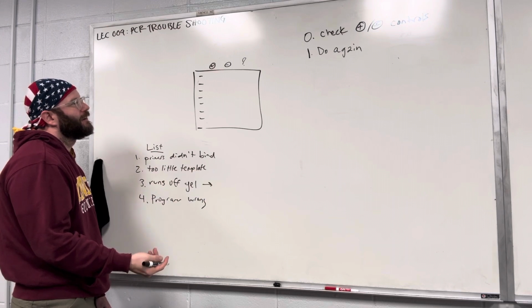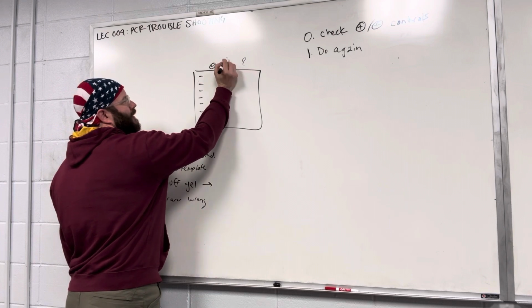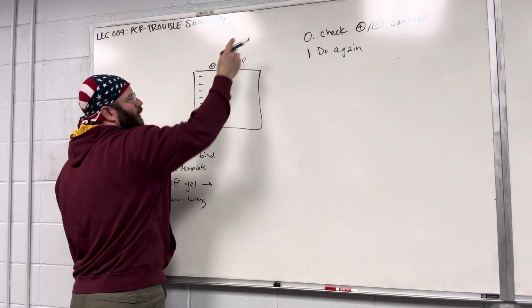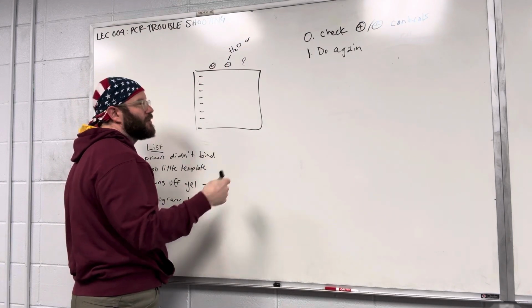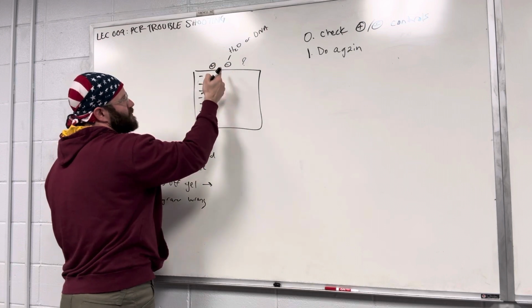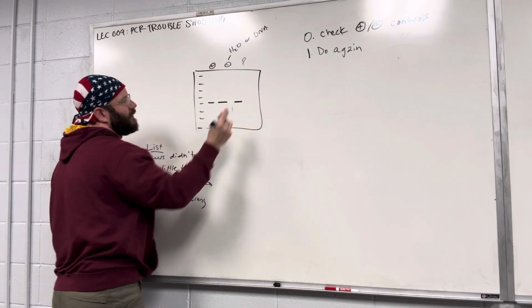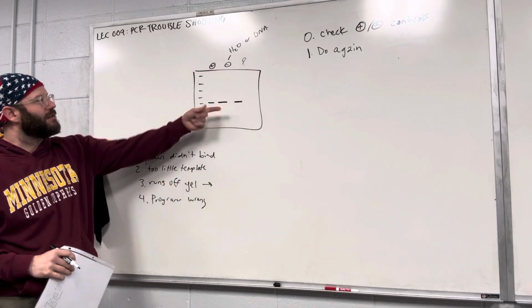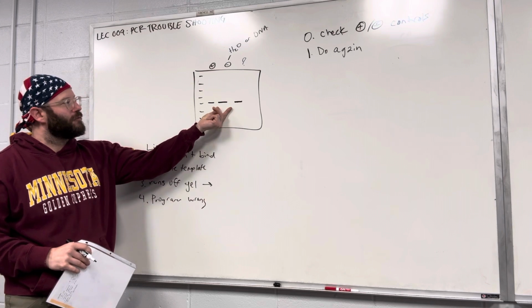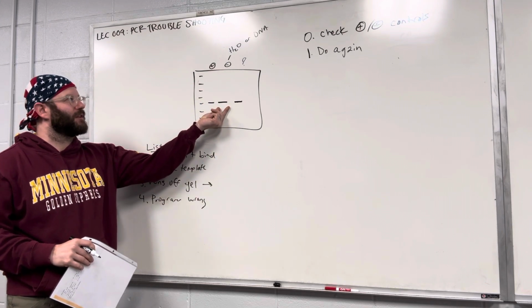A negative tells you if there's contamination. Yes, good. Oftentimes a negative control is either water or, depending on what you're checking for, DNA that will not produce a band. If you saw a pattern where you're getting a band in your negative control, then you know all this data is flawed because something is probably contaminated.